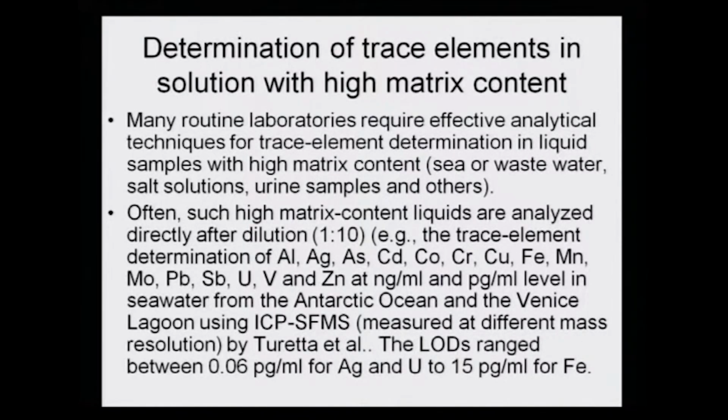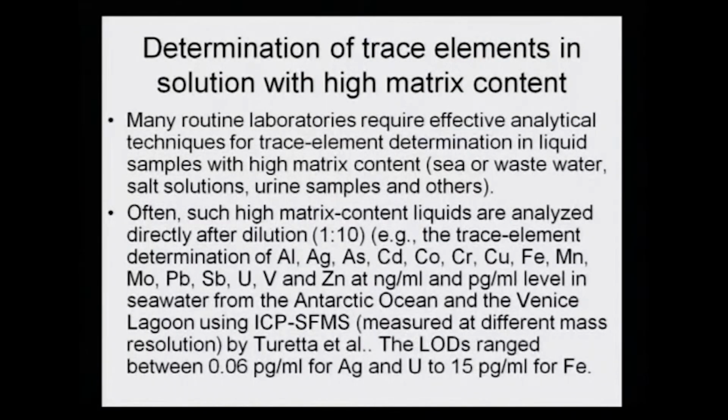Now, you will also appreciate that seawater, wastewater, salt solution and urine samples have a very complex matrix, and to be able to analyze these samples and the metalloid elements from that complex matrix is a big challenge, because the matrix has always offered its hindrances and it has been a challenging job for the analyst. Often such high matrix content liquids are analyzed directly after dilution.